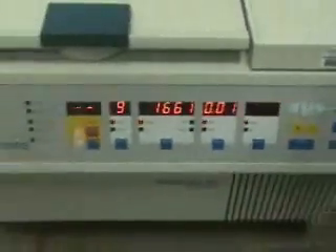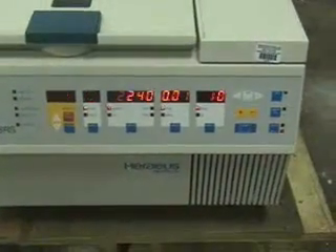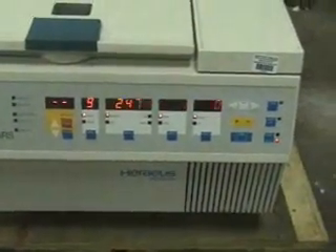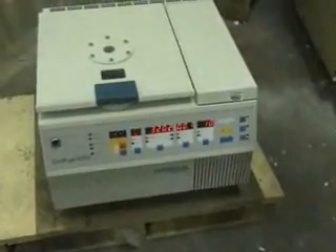If you see the flashing on the display, that's just because of the camera — it's not really happening. The unit chill went all the way down to zero. If you have any further questions, please call 609-518-9100.